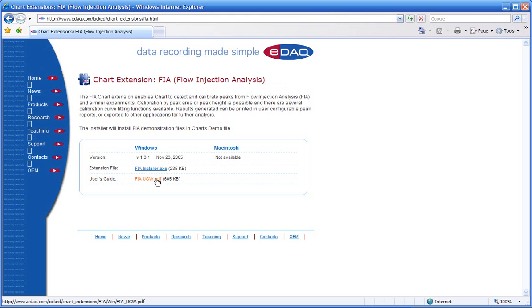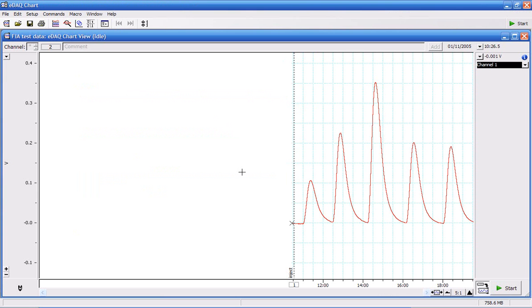Once you've downloaded this, double click to install. This is data showing some peaks. I'm going to use this data to show you how you use the flow analysis extension.